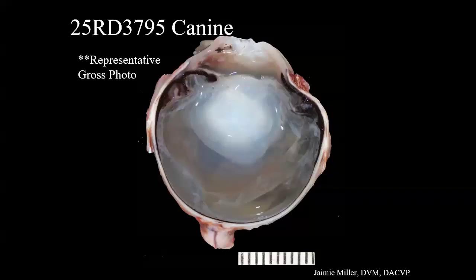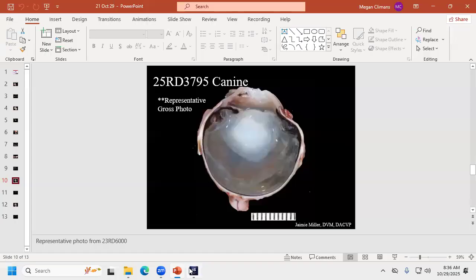So grossly, both eyes were fairly similar. They were both buphthalmic, maybe the left eye a little bit more than the right. The lenses were invariably either posteriorly luxated or subluxated with a cloudy lens, kind of like here. And we said the vitreous was thin in both eyes. There was maybe a little bit of hemorrhage in the left eye, maybe not represented well in this picture. But we did say that the right eye had some white strands also in the vitreous, which can be seen here. So what's going on?